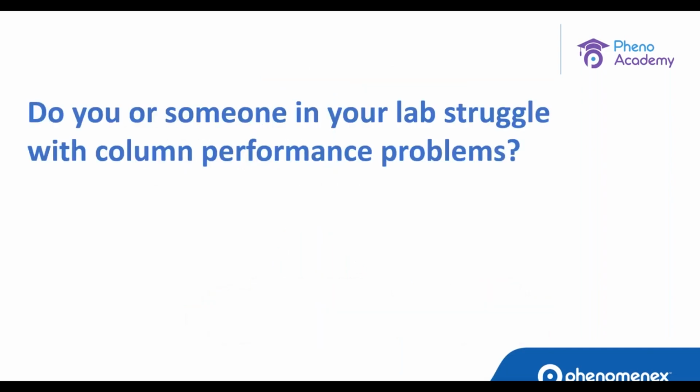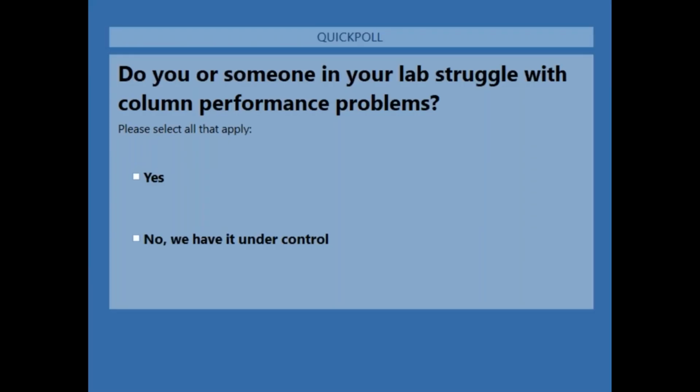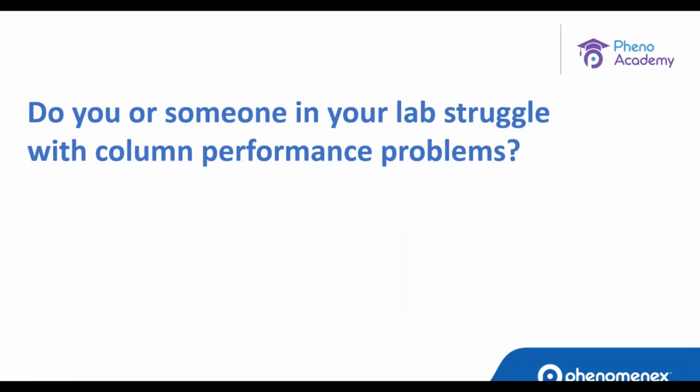So let me take a quick break here, and I want to ask all of you, do you or someone in your lab struggle with column performance problems? Okay, if you answer the question, I will continue.